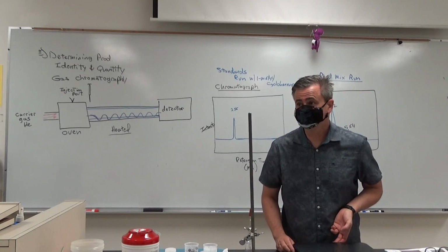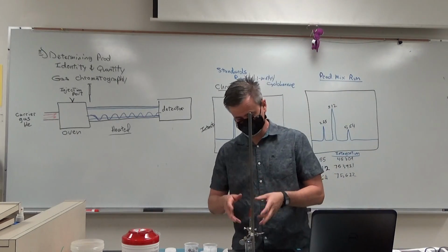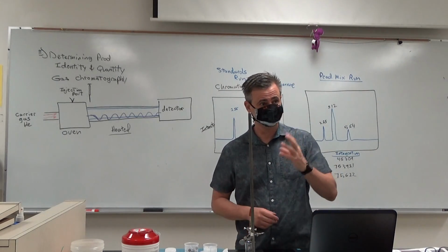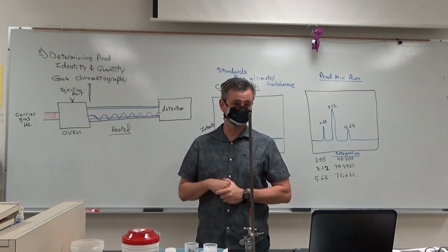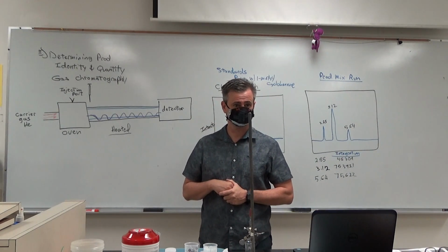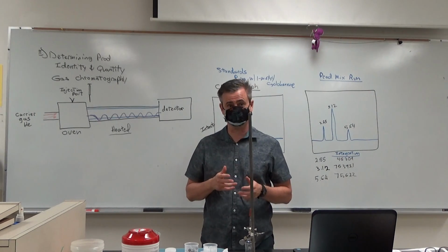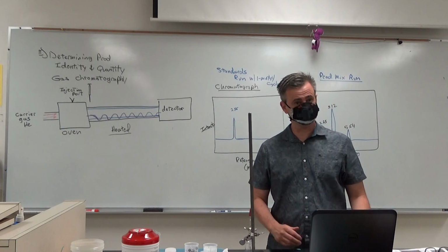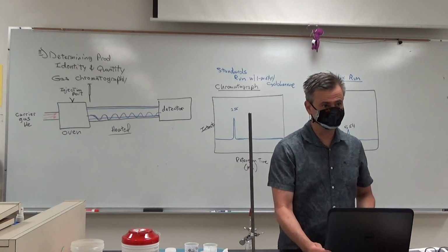Wait, does this have to be done under the hood? This has to be done in the hood. Yeah, this part, so you're going to build this apparatus and everything, take it into the hood, and do this part, okay? Oh, the filtering part? The filtering part, yeah. Oh, okay. Yeah, yeah. Chloroform is a carcinogen. It's a mild carcinogen, but nonetheless, it's a carcinogen, so we want to take precautions.